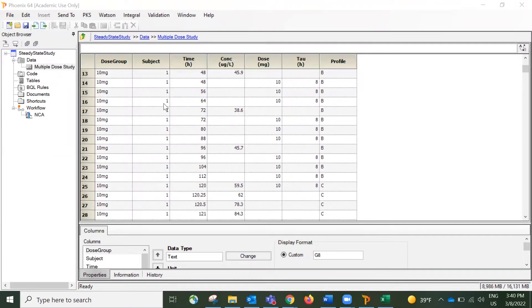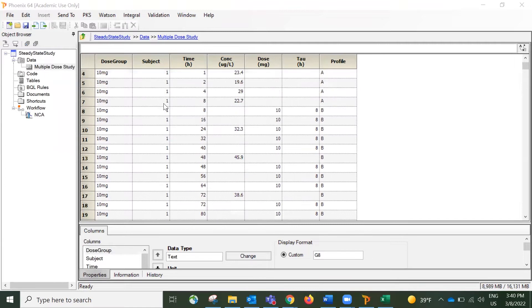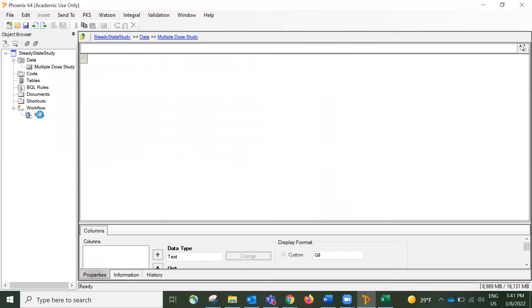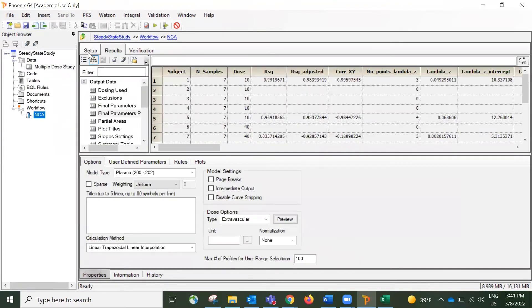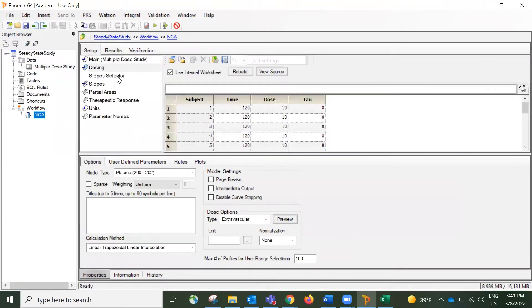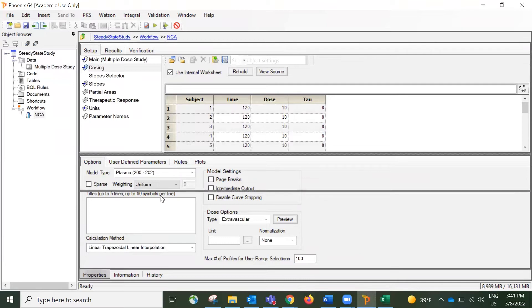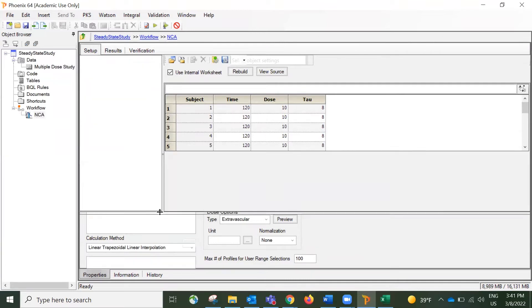So we want to run an NCA analysis for the steady-stage data only. So how to do that? Let's take a look at the setup tab since this object has been executed already.